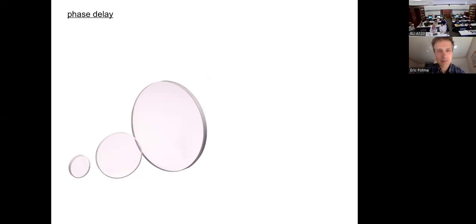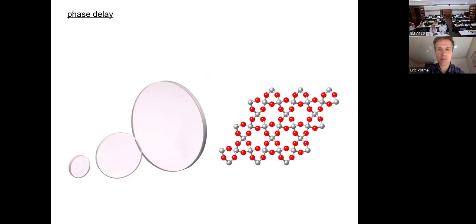Nothing gets absorbed, but you can still see it. I can see that there's some material sitting there, and the reason why you see that is because there's a lot of refractive effects, okay? And phase delay is one of them. So if you send your light just head on through this material, then you can still notice that it passed through this material, even though there's no absorption, because its phase has changed as it propagates through it.